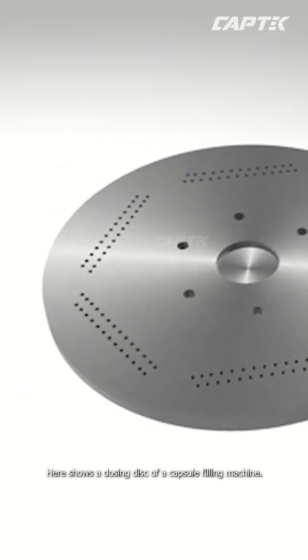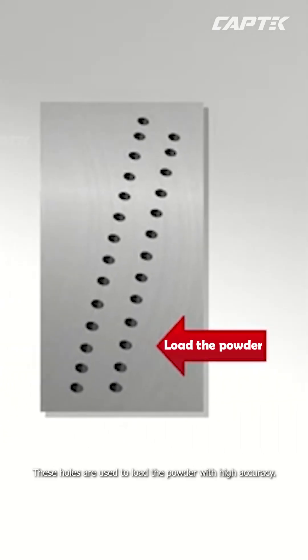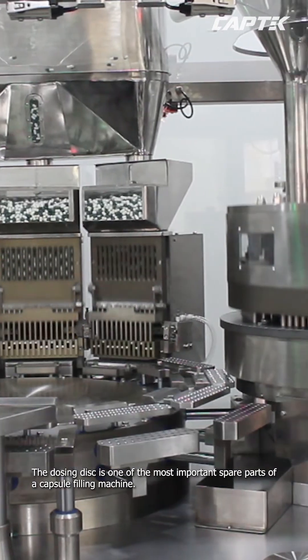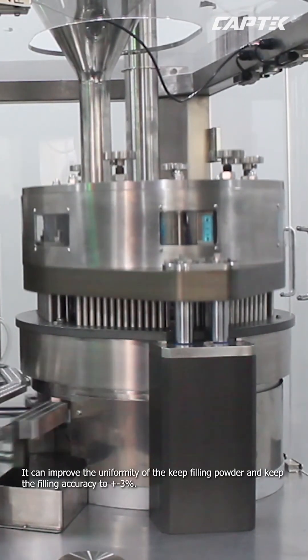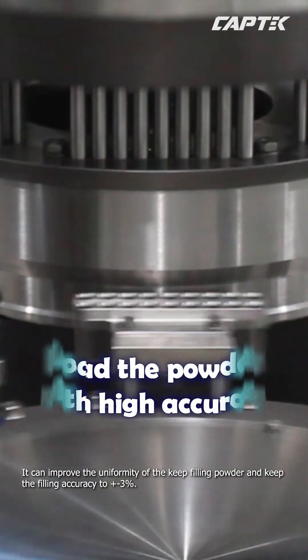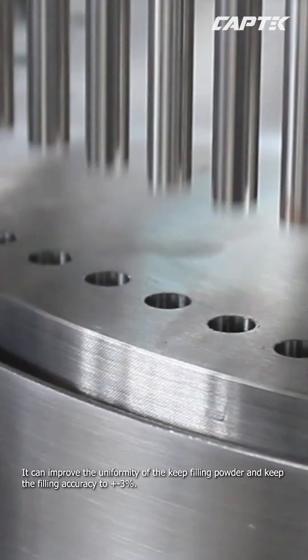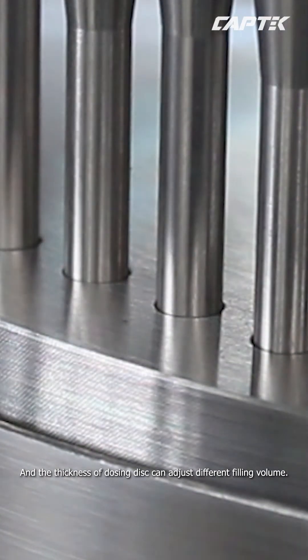Here shows the dozing disk of a capsule filling machine. As we can see, there are a lot of poles on it. These poles are used to load the powder with high accuracy. The dozing disk is one of the most important spec parts of a capsule filling machine. It can improve the uniformity of the filling powder and keep the filling accuracy to ±3%. The thickness of the dozing disk can also be adjusted for different filling volumes.